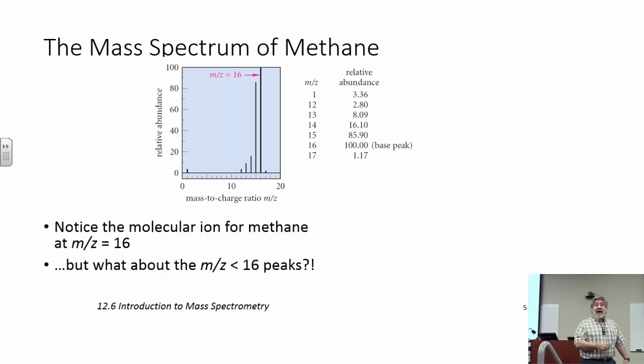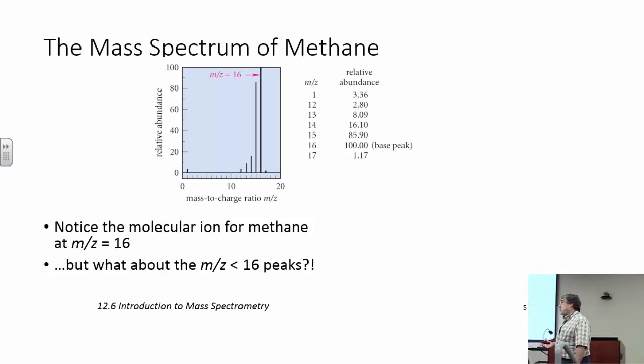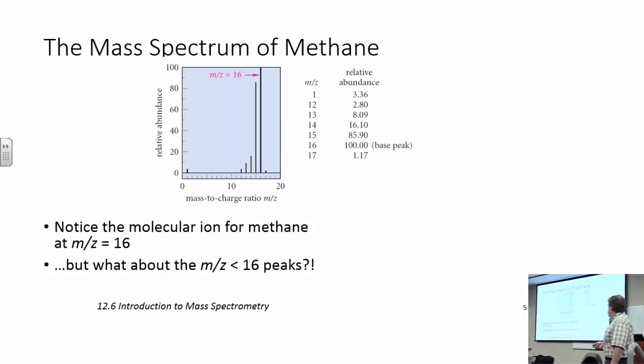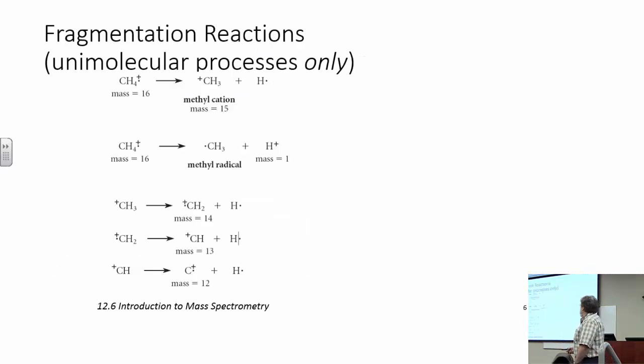All right, the last peak I want to ask you about is what about that 17 peak? Because notice that that's present. And I think that question's actually on the next slide. So good so far? Questions or anything? Yeah, pretty easy. When does it get tough, you ask?